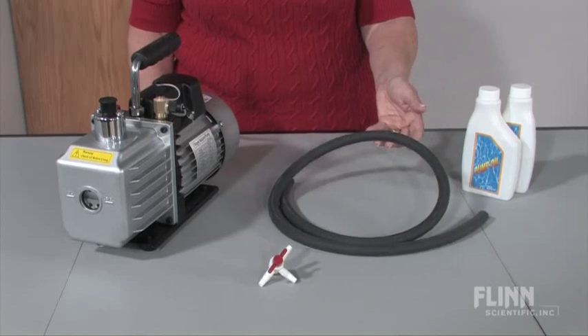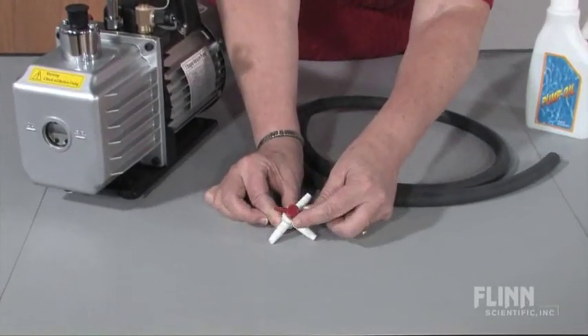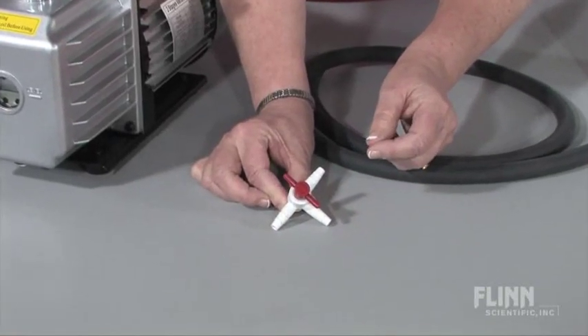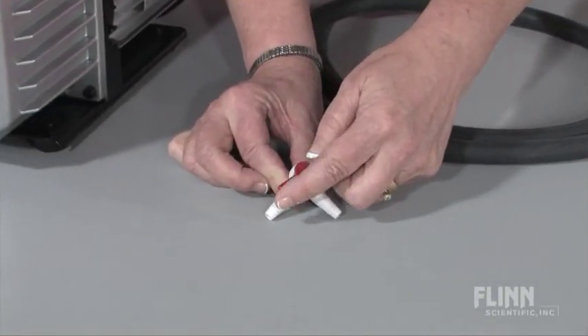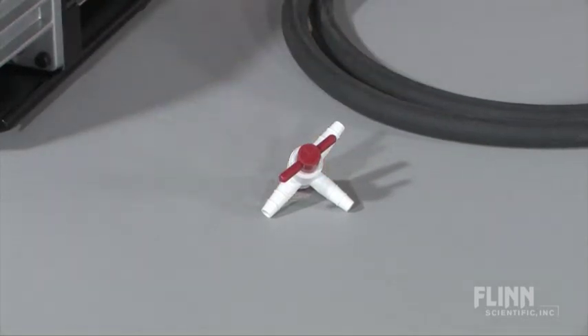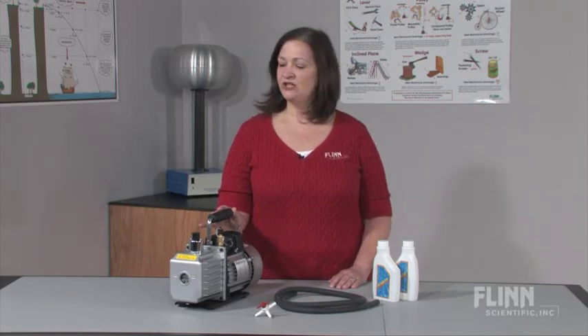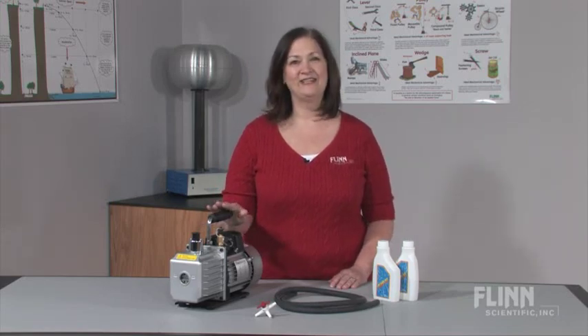including thick wall vacuum tubing and a three-way valve, which allows you to seal off the vacuum chamber and then vent the pump to the atmosphere before turning it off — a recommended step that will increase the life of your pump. Count on Flynn's two-stage vacuum pump to be a dependable workhorse in your lab.